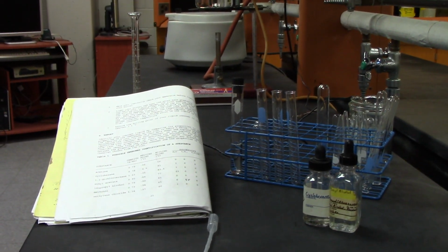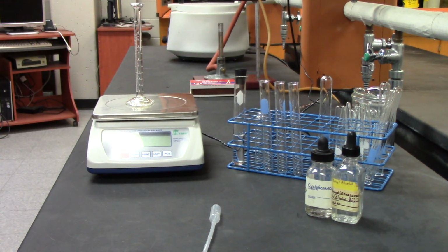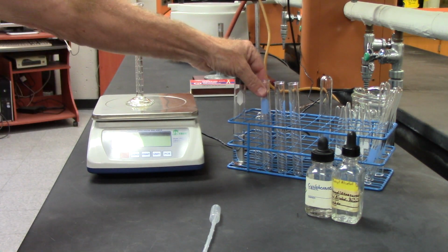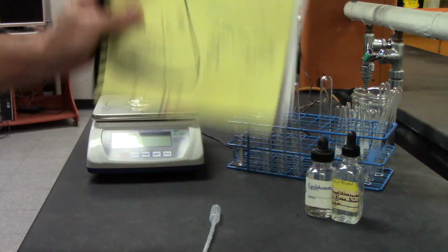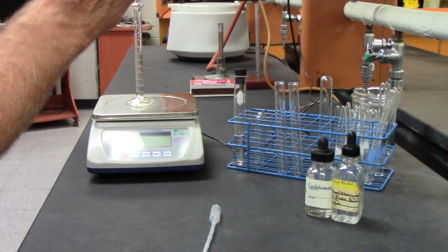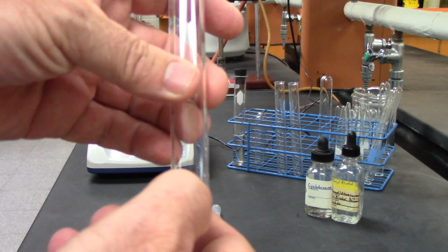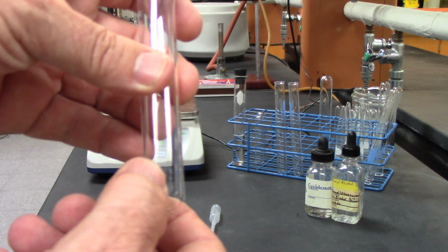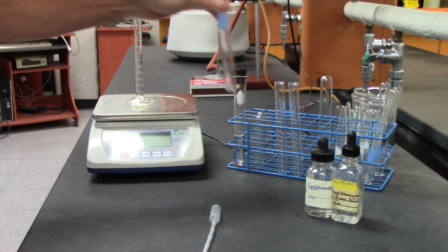It's pretty straightforward. Okay. First thing I'm going to do, in your lab book it says measure out 3 mils. I'm not going to do that. What I'm going to do is add about this much, up to about here. I don't have to be super precise because what we're looking at is an intensive property.